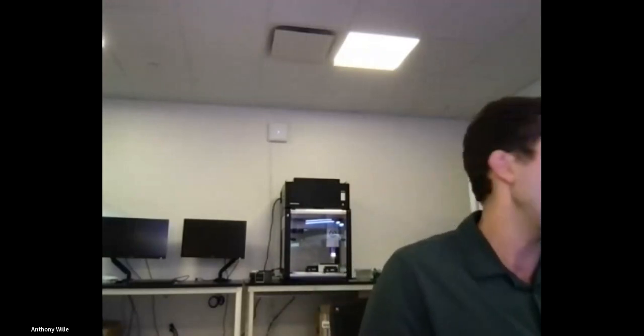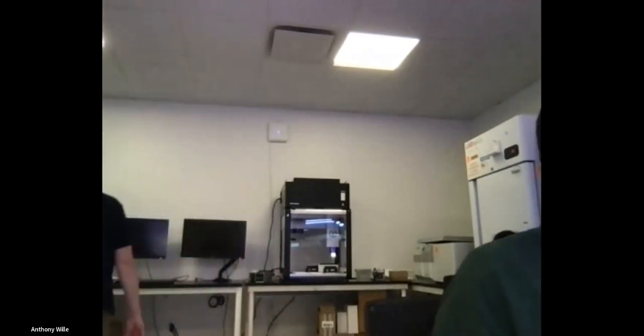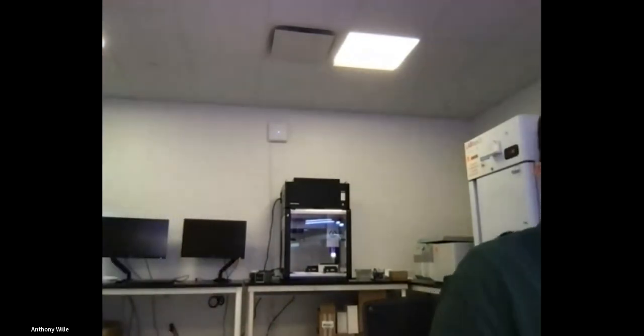Can you elaborate a little more on how the Flex automatically calibrates? I'm not going to actually run through the calibration workflow here, but I will show you just a little bit on the deck itself of how this is done. As you can see, each deck slot has a steel plate in the center of it. There's a hole cut in this plate, and the pipette uses a probe, which is attached to the inside of the machine's case with this nice little magnet.